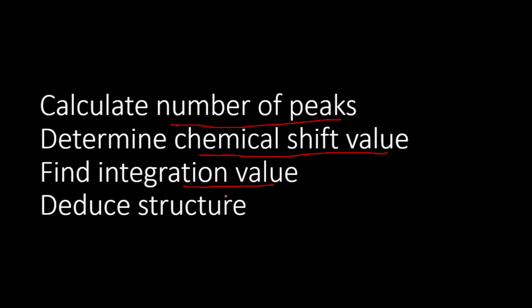or the given values. It may be given in the digitalized form, or it may be given in the scale form, or the molecular formula is given. You may also find integration values from the molecular formula if only the same kind of the protons are present. And at the last we will elucidate our structure simply.